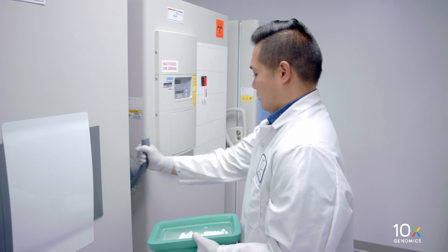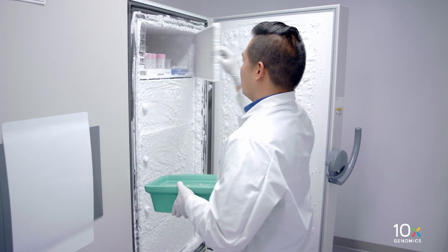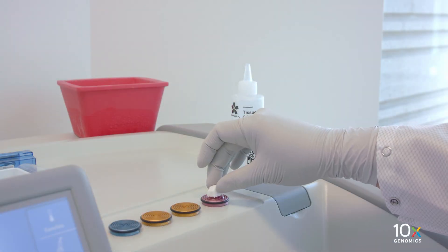Store frozen OCT embedded tissue in a sealed container at minus 80 degrees Celsius or in liquid nitrogen for long-term storage, or immediately proceed to cryosectioning and section placement. We have frozen and OCT embedded the fresh tissue, and next we will prepare the cryosection.